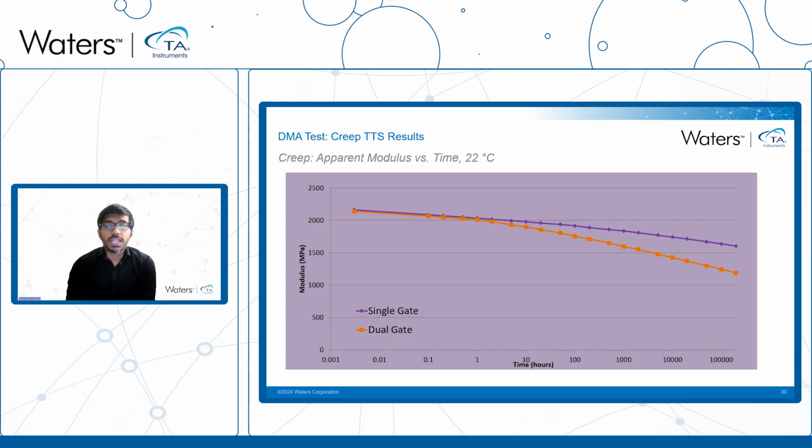This plot is an indication of deflection over time due to creep, and this information can be used to predict the magnitude of your material deformation from creep and understand when a material may creep and no longer perform its intended function. Some examples of material experiencing creep during service are clothes hangers, bookshelves, ceiling surfaces, etc.